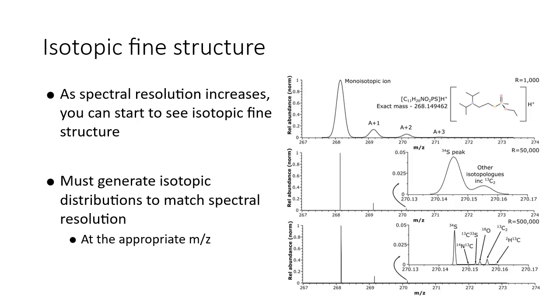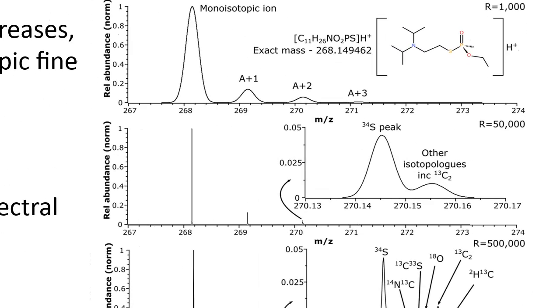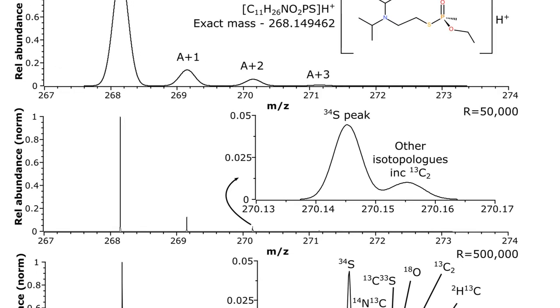So if we consider the isotopic distribution of the nerve agent VX, if we were analysing that on a low-performance mass spectrometer with a resolution of only 1000, then we'd only be able to detect up to 4 different isotopolog peaks. However, if we were using a much higher performance time-of-flight mass spectrometer with a resolution, say, of 50,000, then in the A+2 peak we'd see that now begin to split into 2 different detectable isotopolog peaks. Because the peak corresponding to the structure containing one 34S isotope is detectably different in mass at that resolution from all the other A+2 isotopologs.